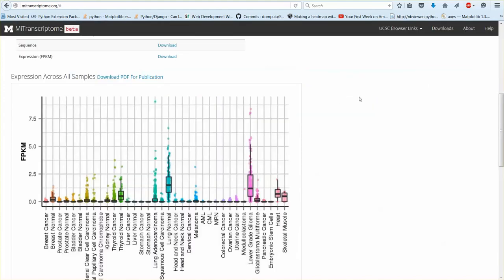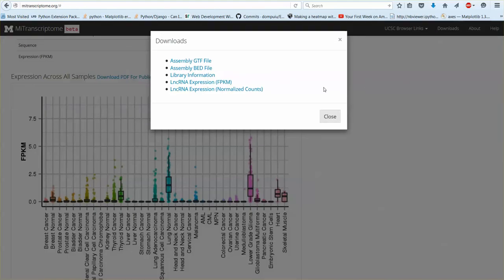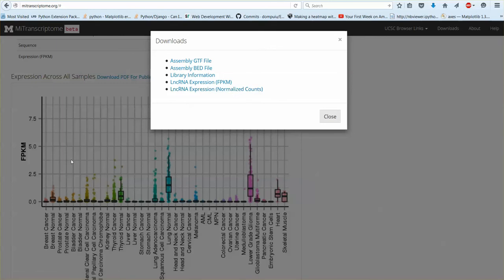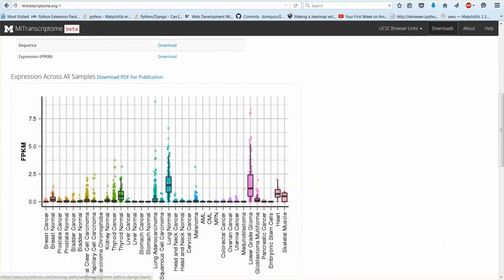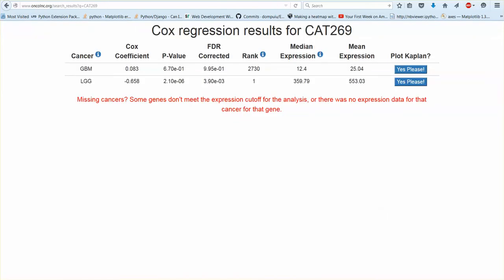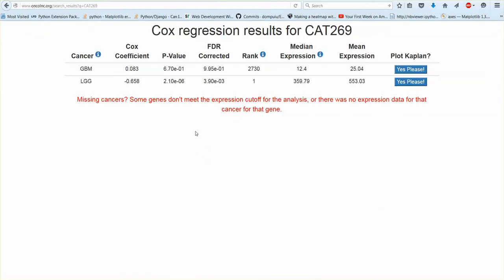The files that I used for the analysis was the normalized counts so that's why the numbers don't correspond. They're showing FPKM and I'm using their normalized counts. Okay so that was long non-coding RNAs.